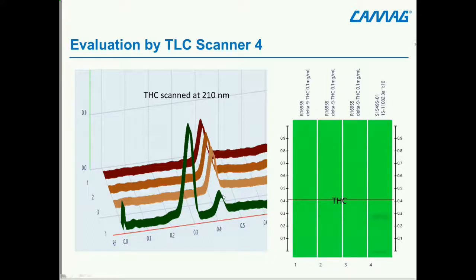What you can also see here is that we have another big peak here, which is the THC acid. THC acid is, during decarboxylation, transferred to THC.